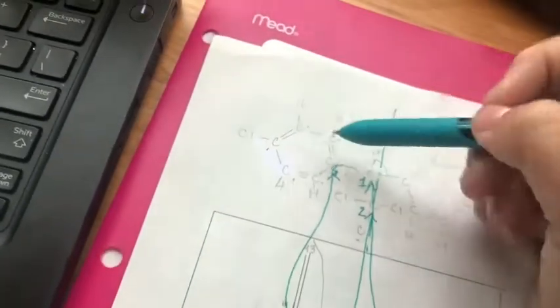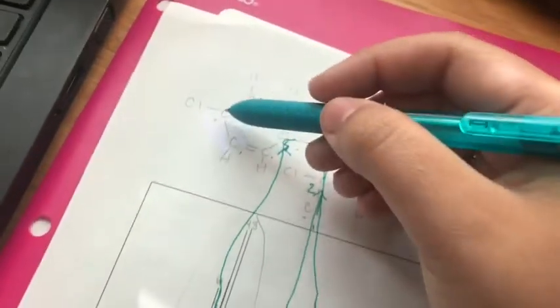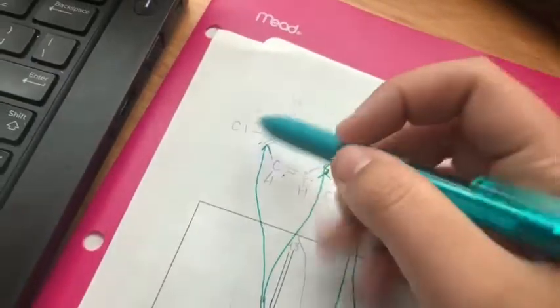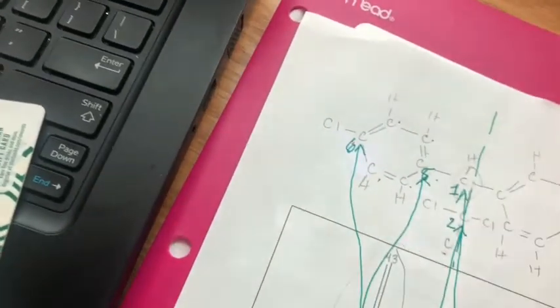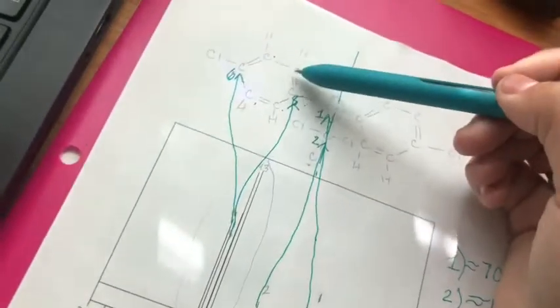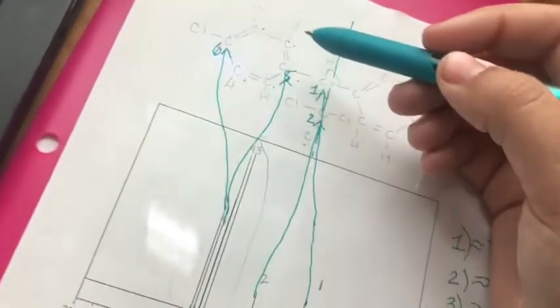And then let's just do the 2 carbons that we know are not going to be the same as another carbon. So this carbon right here, that one's going to be number 6 because it's the most deshielded due to it being directly connected to that chlorine. So this one's number 6, this one's number 5, and we know we have 1 and 2. So let's see what this set of carbons is going to be, and then this set of carbons.